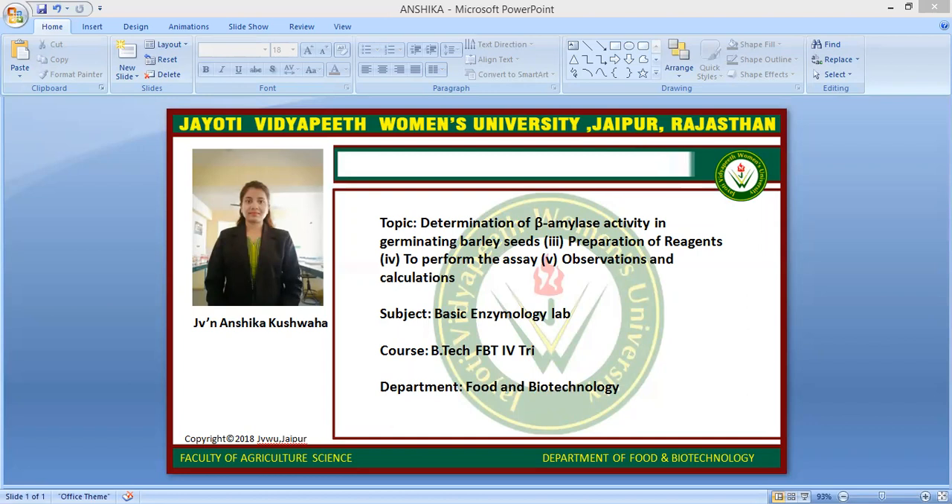The volume of the amylase extract is recorded. A 5-fold dilution is then done by pipetting 5 ml of the amylase extract and adding 20 ml of buffer to make a total volume of 25 ml. A control is then prepared by adding 5 ml of the amylase extract in a test tube and placing it in a water bath at 80 degrees Celsius for 10 minutes. When 10 minutes have elapsed, the control is removed and allowed to cool to room temperature.